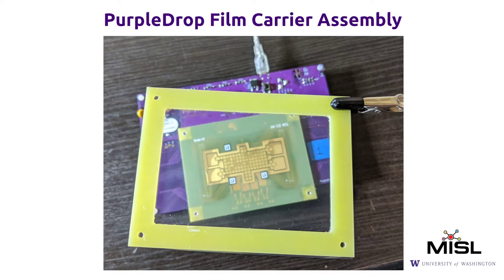Hello. In this video I'm going to walk through how to assemble the dielectric film carrier for a purple drop. It's essentially a FR4 frame with a film of mylar adhered to it and a hydrophobic coating spin coated onto that.